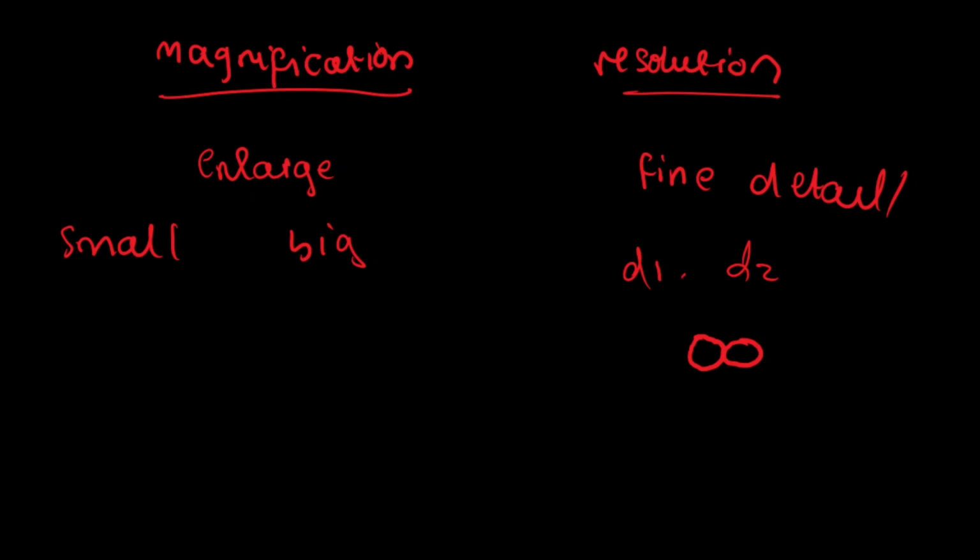So magnification would simply enlarge the image, making it bigger, but resolution will help us to see distinctive details, distinctive features of the structure.